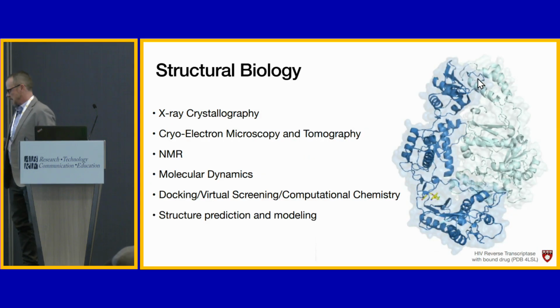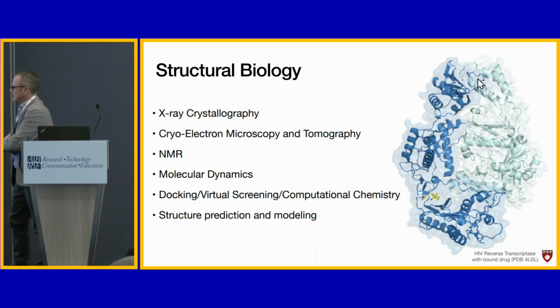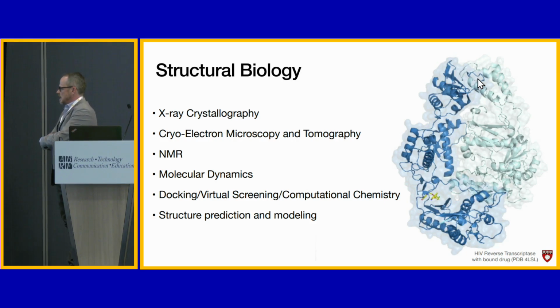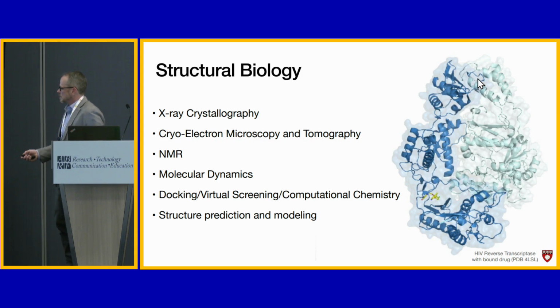So how do we define structural biology? Because I know that maybe not everybody here is a structural biologist. Data derived from X-ray crystallography, cryo-electron microscopy and tomography is, I think, the main data volume these days. NMR, of course, is a popular technique mostly in drug discovery these days, for looking at compound binding fragments, protein dynamics. Molecular dynamics is computationally looking at those dynamics. Then there is drug discovery by virtual screening and computational chemistry.